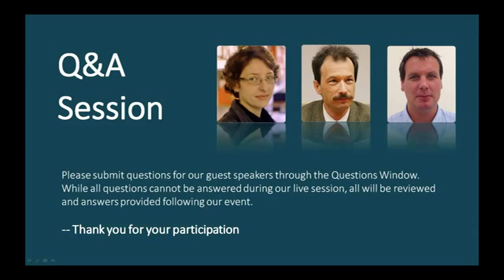Okay. So, I guess there are multiple levels at which social interaction can be divided for a particular test, both within a single cage and with different groups of animals, how they're trained and exposed to one another and their cues, but then also applied across any number of IntelliCage systems running through one central unit. Holger, you mentioned 8 IntelliCages can be connected to one data acquisition, is that correct? So is it fair to assume that a test of this nature could be expanded into a high throughput test, where you had this type of social interaction being tested in individual cages, but then also comparing cage to cage, et cetera?